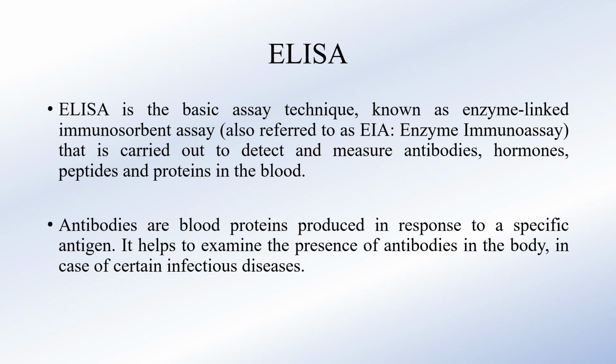Antibodies are the blood proteins which respond to a specific antigen in our body. It helps to examine the presence of antibodies in the body in case of certain infectious diseases. Means if we have any infectious diseases, we can detect the presence of antibodies in our body with the help of ELISA technique.